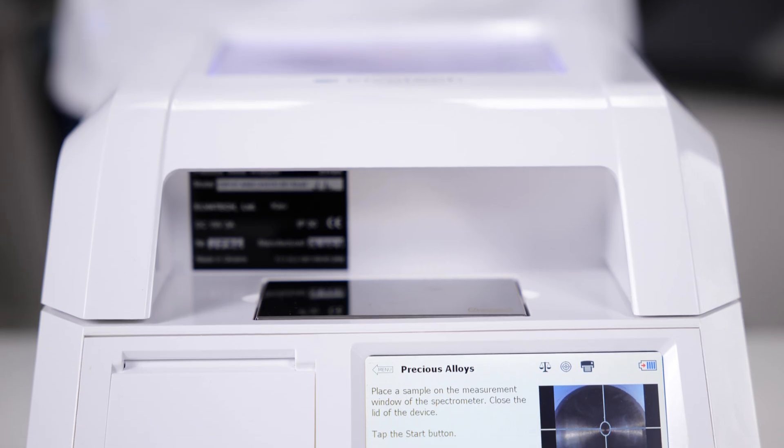This analyzer also has unique features such as detection of plating and non-standard alloys, determination of object value based on weight, grade and gold value, QR code generation for label printing, and QR and barcode reading by an external camera. Furthermore, our analyzers have features that fundamentally differentiate them from others. First, the spectrometer is four times faster than comparable analyzers, providing twice the precision and detection limits. Second, lifelong stability of energy calibration — unlike similar devices, there is no need to perform energy calibration every time the instrument is switched on. Calibration automatically adjusts to compensate for fluctuations in temperature, pressure and other factors. All these features are made to provide you with the most accurate, fast and convenient analytical solution.